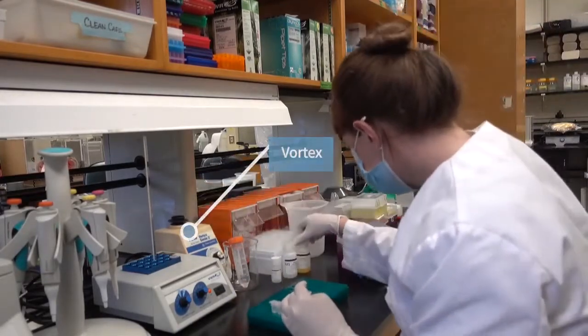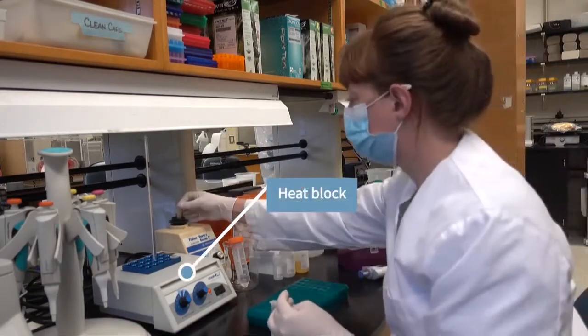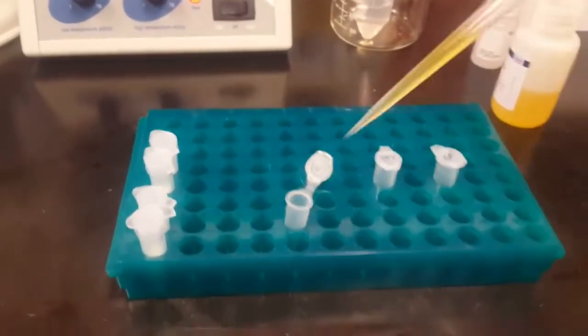And now you can see me mixing my sample together using a machine called a vortex, and then I'm going to be incubating it at a specific temperature on a heat block. And here is just a close-up view of that process.